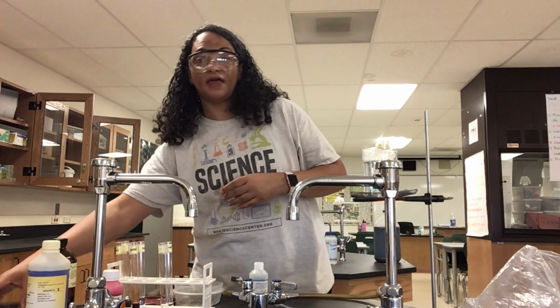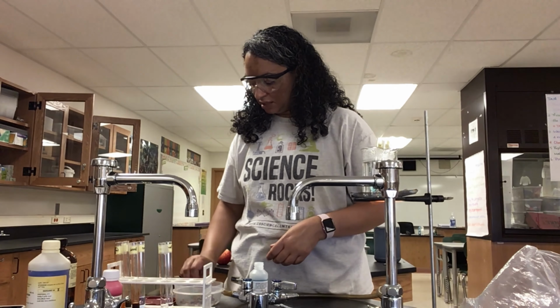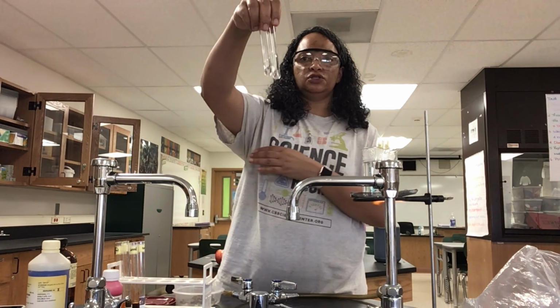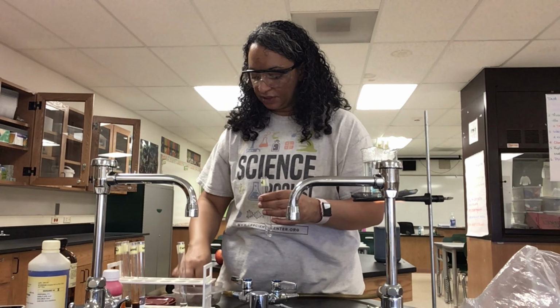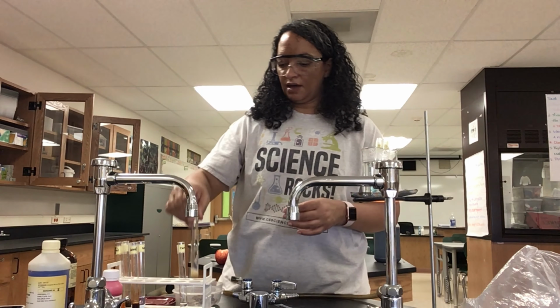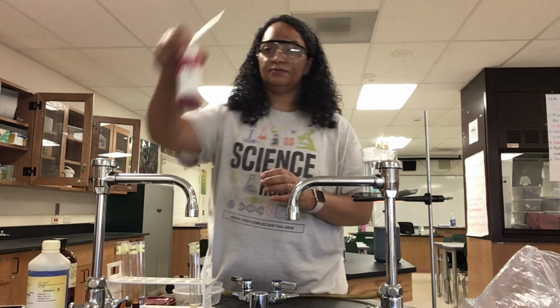All right, while that is going, we're going to go ahead and do the fat test as well, the lipid test. So let me get this Benedict's put away. We don't want to leave it open. And I'm going to grab my last set of test tubes. They have nothing in them, my control and my seed. The one that says seed, I'm going to put some paste in there, some acorn paste. Okay. I'm going to get my last clean pipette, and I'm going to get Sudan 4.